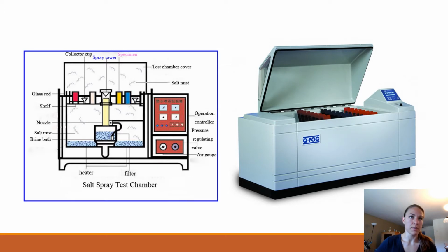So this is just a simple schematic of your typical QFOG salt chamber. This is what we use for corrosion testing. As you can see on the right, you place your samples on the inside, and there's a control panel on the right there. You can regulate pressure, temperature. You can sometimes even set up what type of ASTM method you want to use.